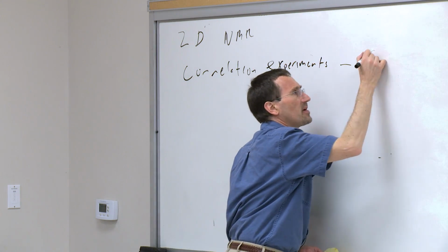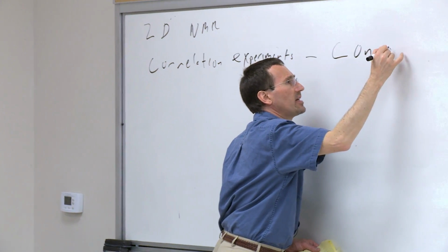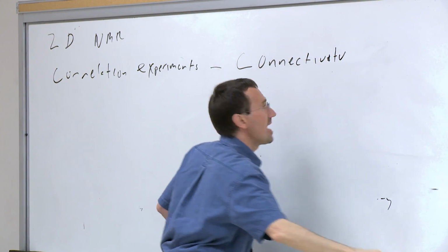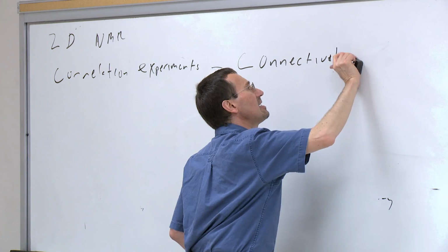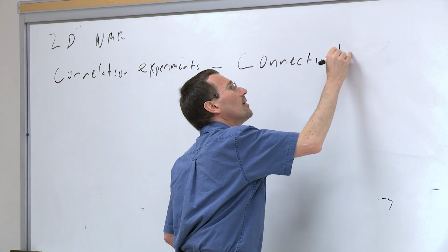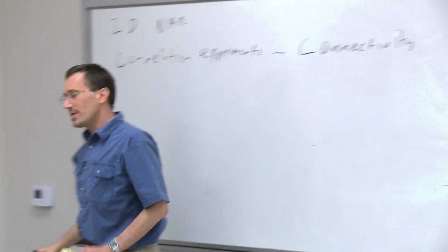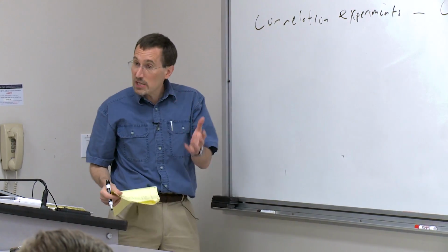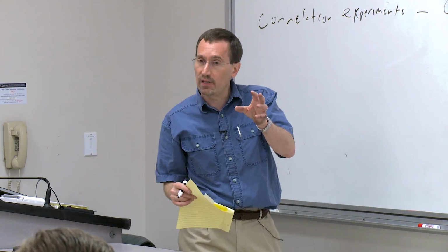And these experiments give connectivity, and this is very useful, because they can help you tell what's connected to what. Connectivity, you get it already from coupling patterns.